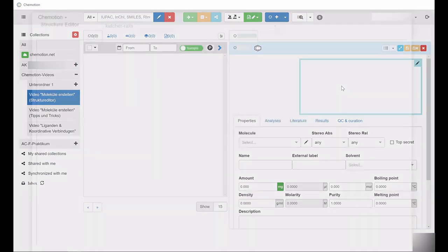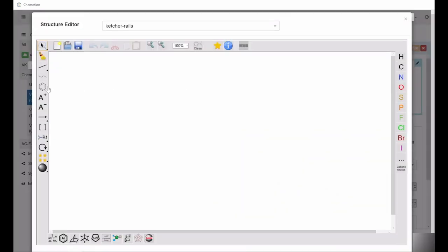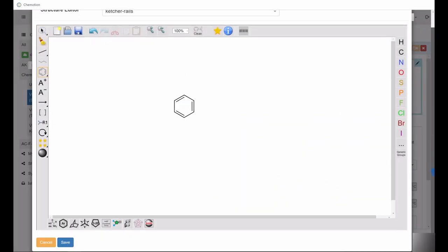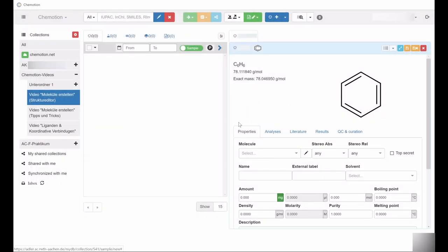For demonstration purposes, we will use benzene as a model compound. After creating and saving a structure, you can select an automatically proposed name for the molecule under the category Properties.